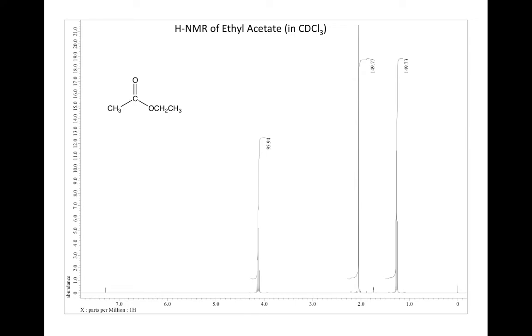So let's go back to our spectrum here, and let's start out with the first of those things, the integration. Here I've got the integration, and on our NMR it already prints out the relative size of these integration peaks. Now if these weren't written there, and commonly they're not, if you find spectra from various sources, you would have to measure the distance from this line right here where it starts up to where it finishes up here. I would recommend investing in a ruler that has a millimeter scale on it, and I usually just measure these out in millimeters.